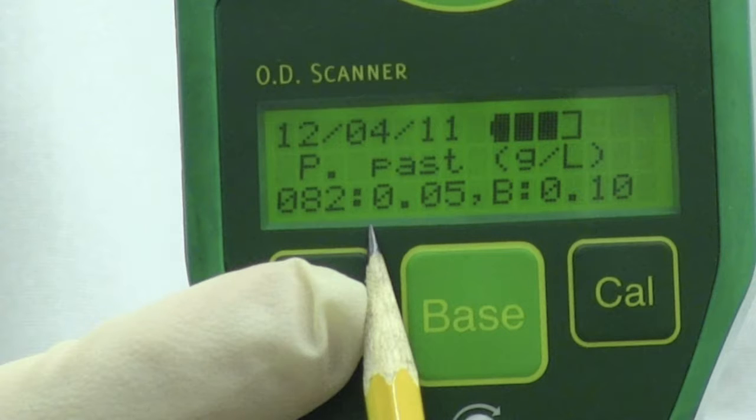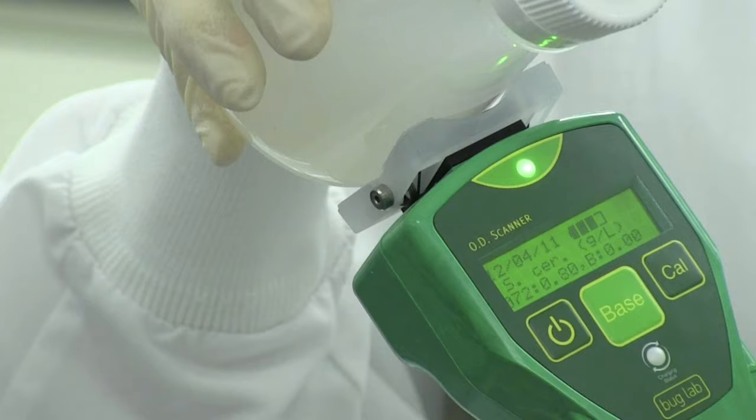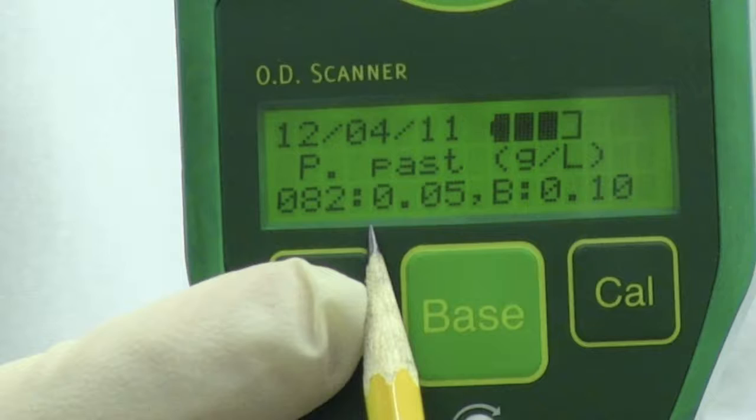The cal button allows you to select the type of organism and units in which you would like to report biomass. Press this button until a particular organism you are measuring is shown. The standard biomass calibration provided on the scanner is for dry cell weight in grams per liter of Saccharomyces cerevisiae. Adding custom calibrations is easy to do with the provided user interface software as described in the user manual.